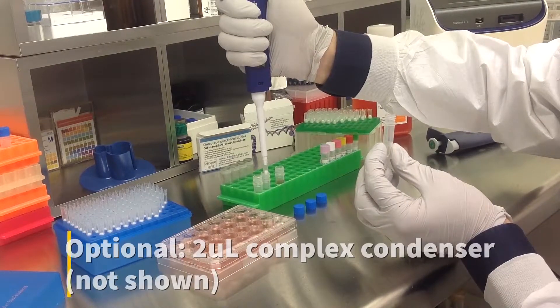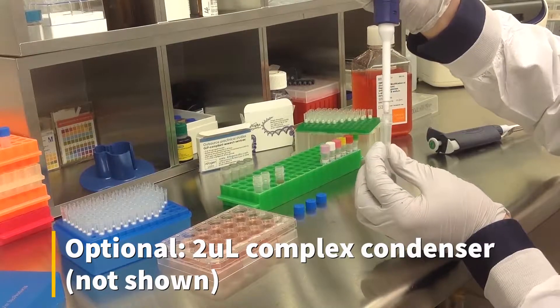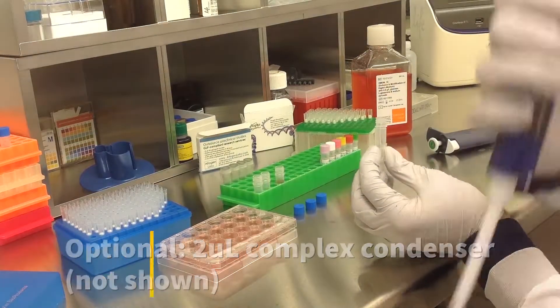An optional step is to add 2 microliters of complex condenser, which increases transfection efficiency, but may also increase cytotoxicity.